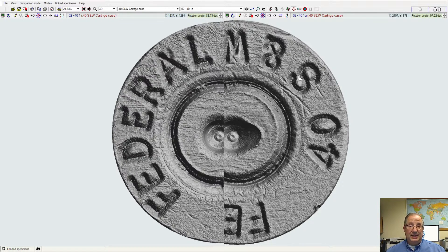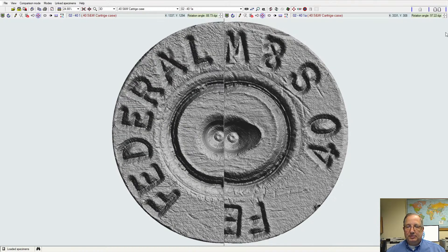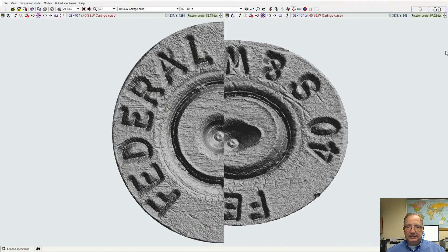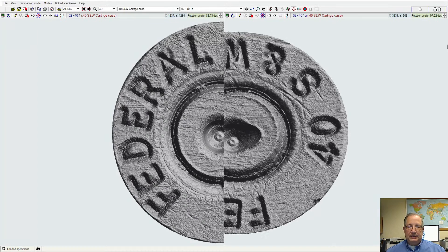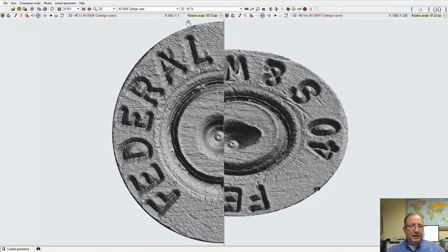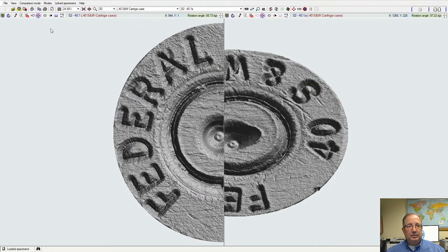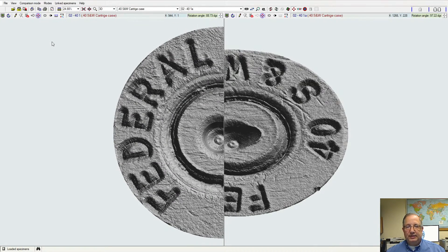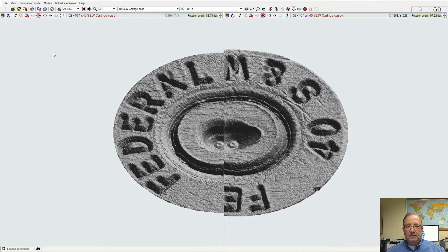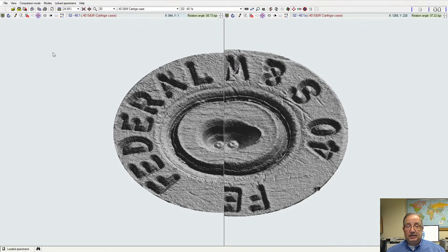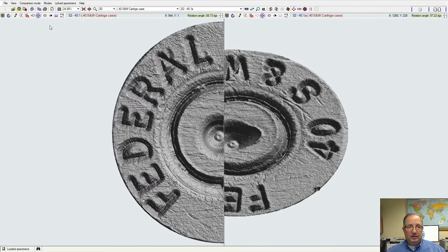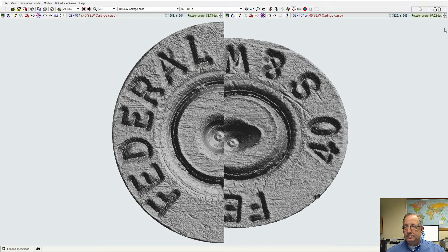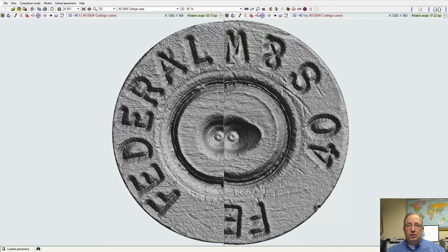So we've shown you the XY manipulation of the sample. We can also tip the sample back in the Z axis, so you can see this tip it back. So if you normally take your sample, tip it back 10 or 15 degrees before you're looking at the face of your cartridge case, we can still do that electronically with this 3D image.